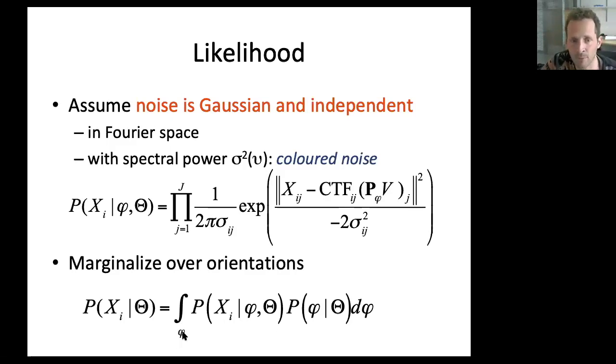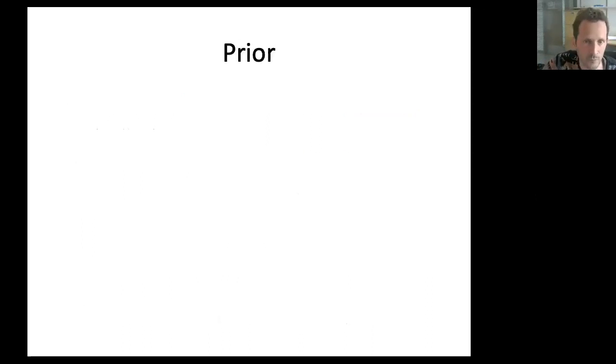So we calculate probabilities for all of them, and there we also have some opportunity to inject prior information on what we know are likely or unlikely orientations. For example, one that is used is that in-plane translations we expect to be Gaussian distributed, centered at the center of the image, and very large translations are not so likely.